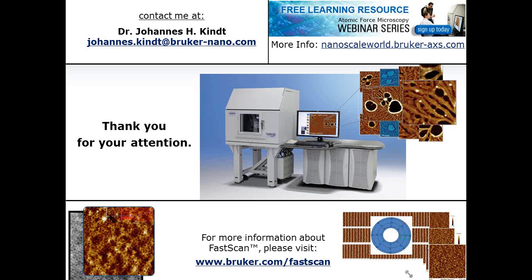Okay, so I showed these examples, but I think there is somewhat groundbreaking work actually coming from the TU Graz looking at these sections. Typically, the AFM at the moment is used for biological material up to eukaryotic cells, individual cells. For multicellular tissues, this is definitely an interesting area, but it is also challenging, as it is to any microscopy technique, and at some point you cross over into the optical microscopy regime.